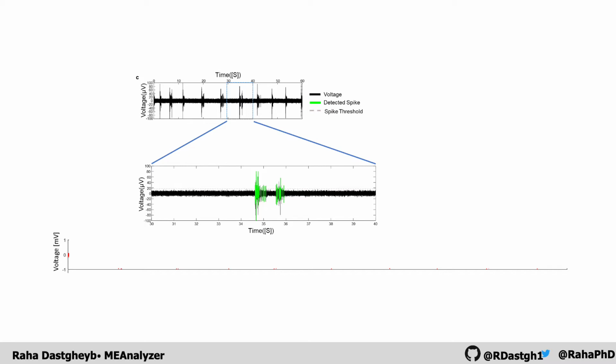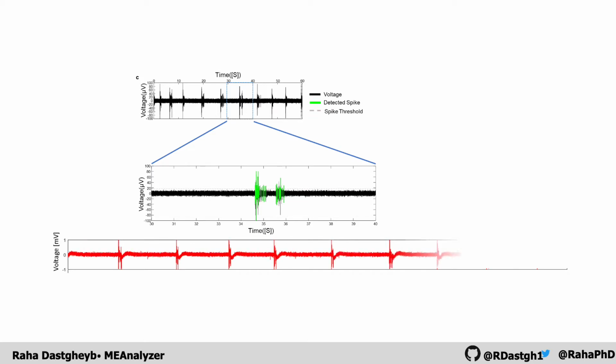So what is a spike and why do we discard the voltage data after extracting the spikes? Some of it is based on what's actually informative data, but there's also a feasibility issue here. So here is an example of just 60 seconds of recording at 20,000 hertz from one electrode. Now imagine that you're doing longer recordings from multiple electrodes, like 60 in this example. It's a lot of data. It's a lot of data to hold in storage. It's a lot of data to hold in memory.